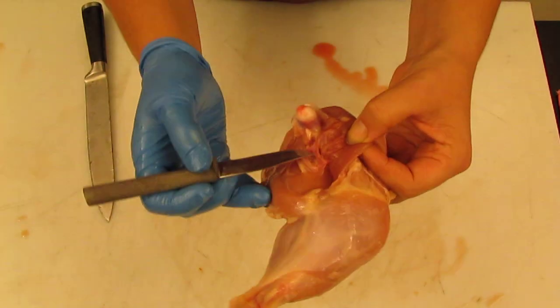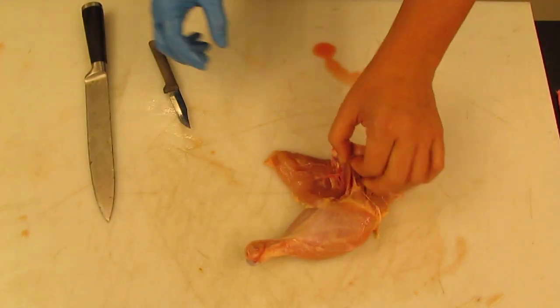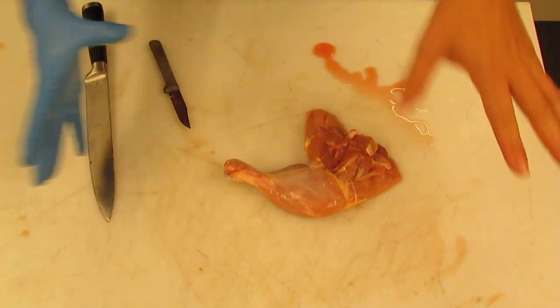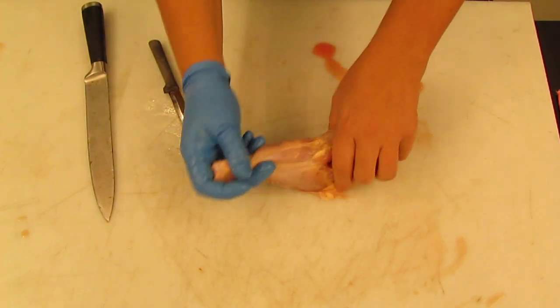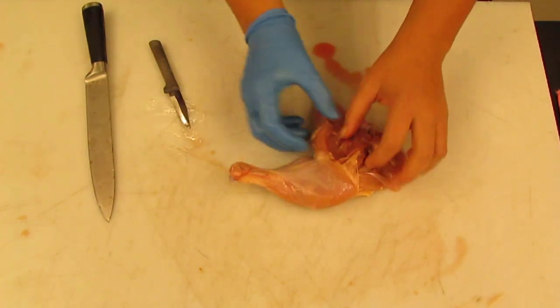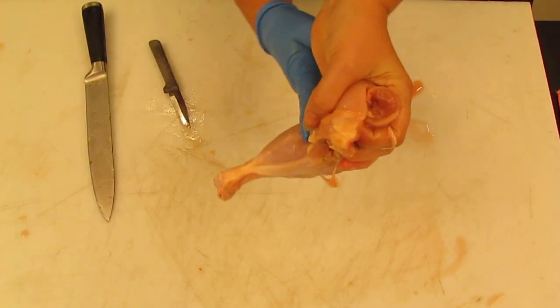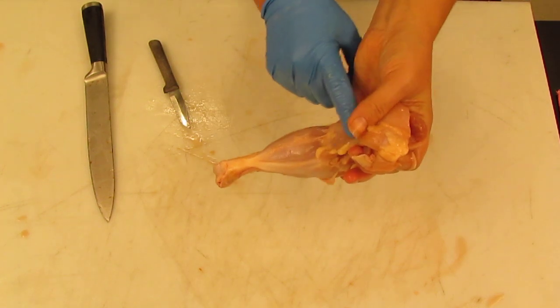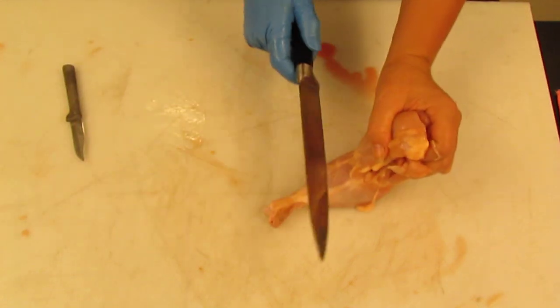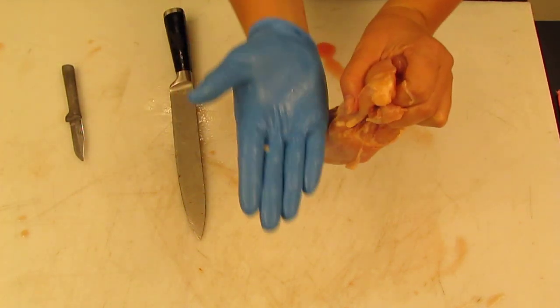And I'll show that up here as well. So blood vessels and nerves here. Okay. All right, so I think that's all of the major structures more superficially here. At this point, we're going to try to explore the knee, right, the joint itself. And so to do that, note that there is a little line, the popliteal fossa, in between the thigh and the calf. And so I'm going to take a knife, whatever knife you have or want, and I am going to cut down in this direction towards the front of the knee.